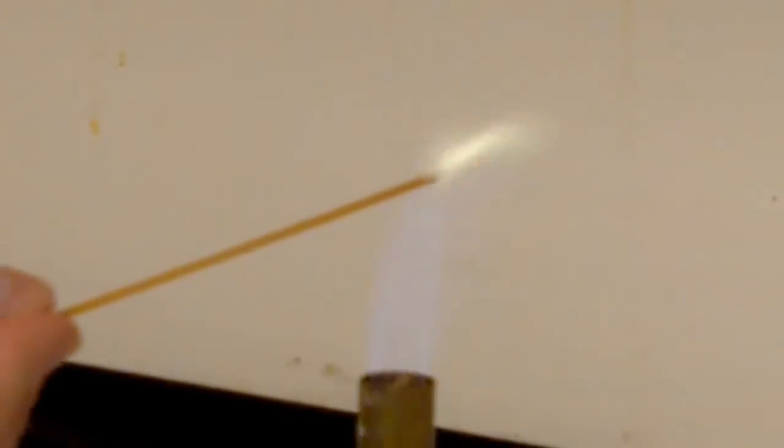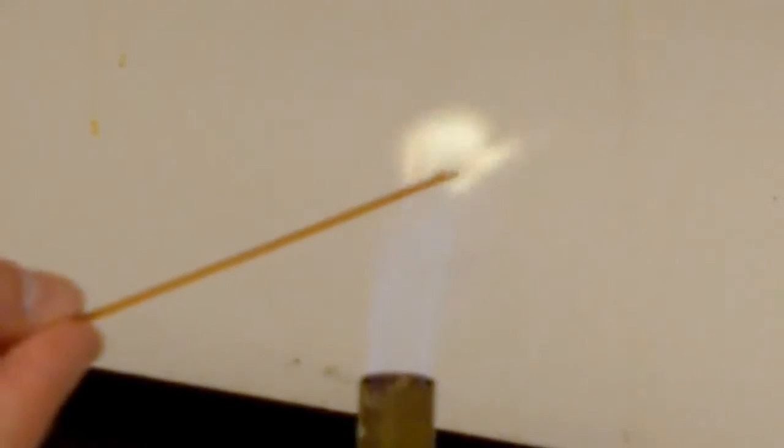Secondly, we will be trying barium chloride, which gives off a greenish yellow color as the barium ionizes.